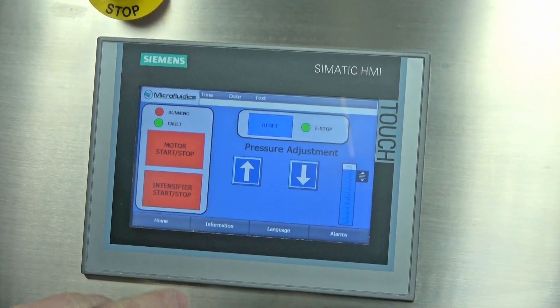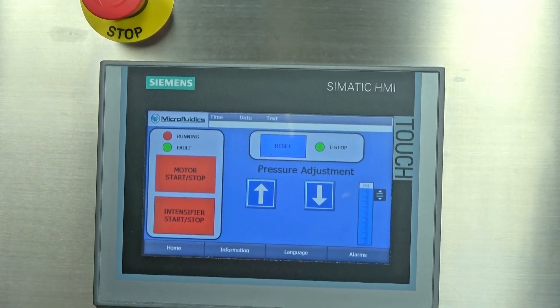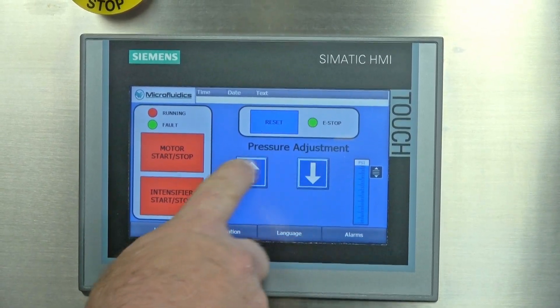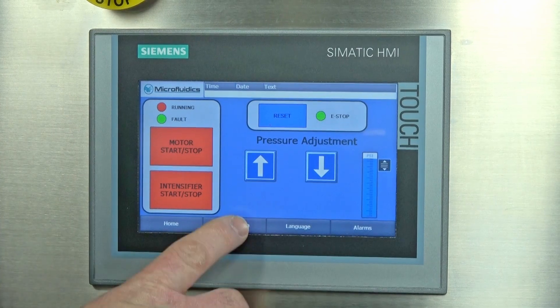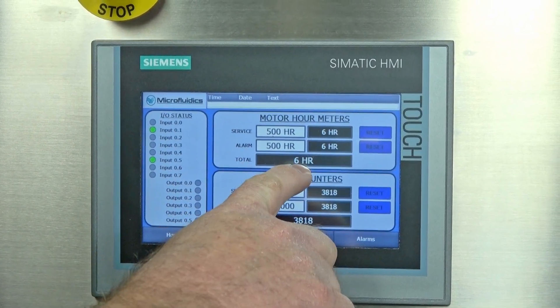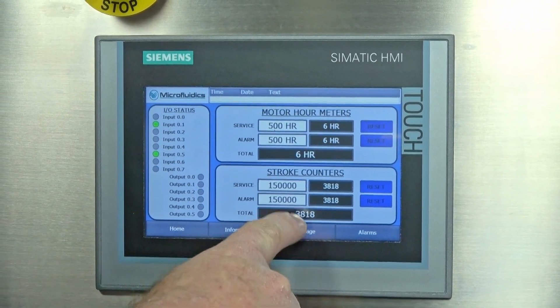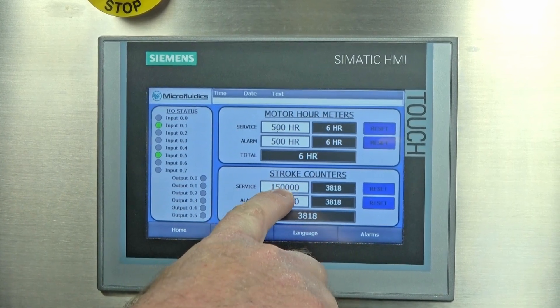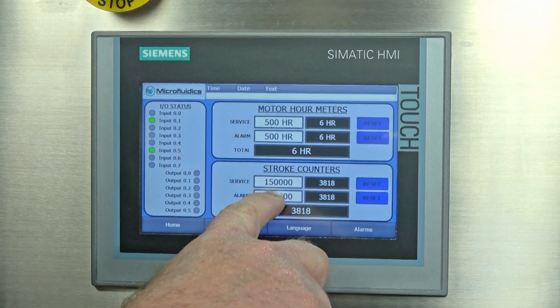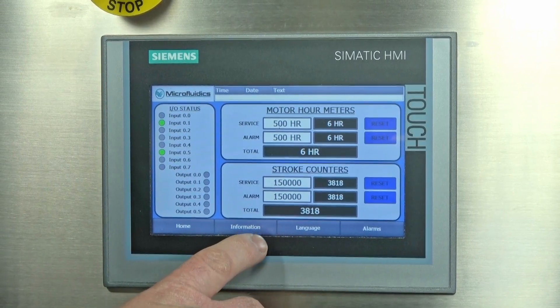Right now you can see we're in the home screen, where you would just turn the motor on and the intensifier, and then simply adjust your pressures with the slide switch or the incremental up and down. I want to go over to the information page to show you: total hours — six hours; total strokes — 3,818.